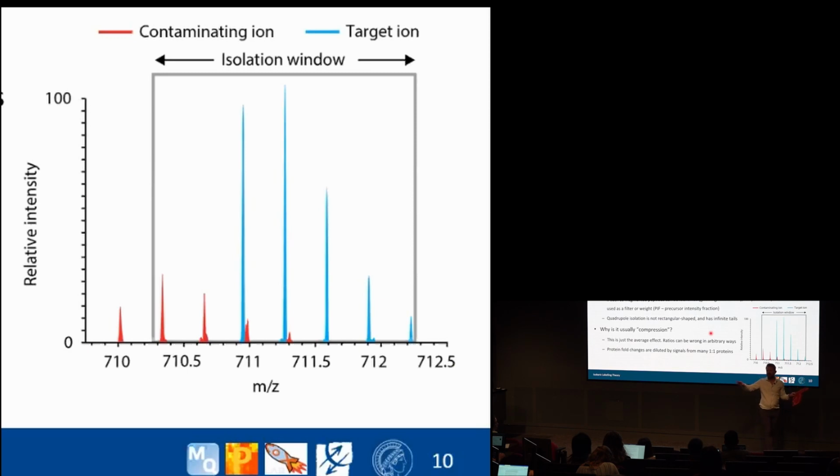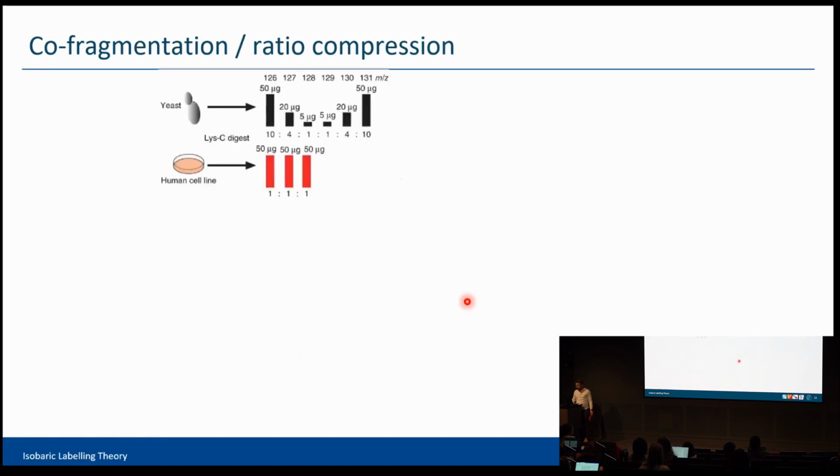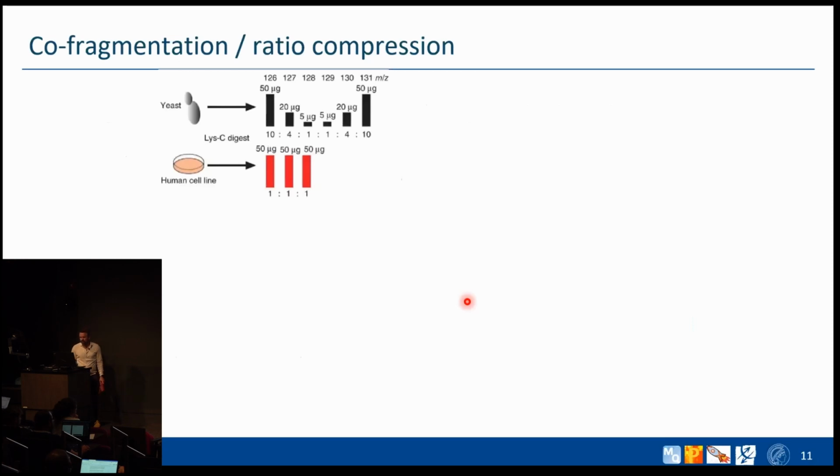So you get some other peptides in your window, which can be very useful in some cases, because in MaxQuant you can take them later and do second peptides and get more identifications. But in the case of isobaric labels, that's not what you want. Because you only have these reporter channels, and probably they also end up in these reporter channels together with the selected peptide.